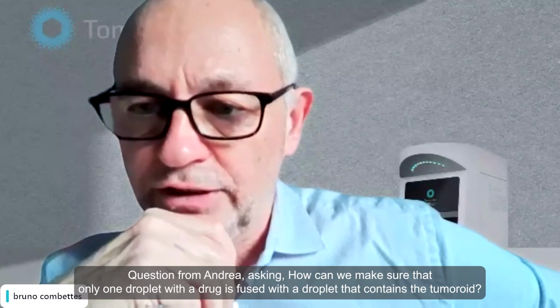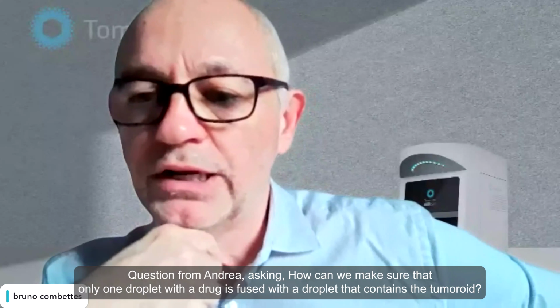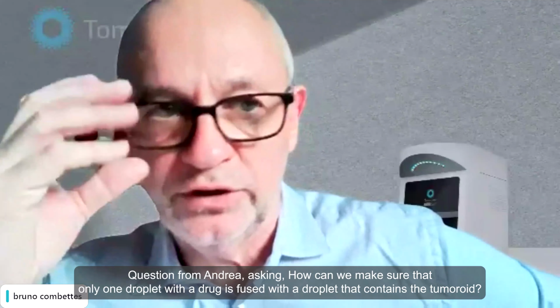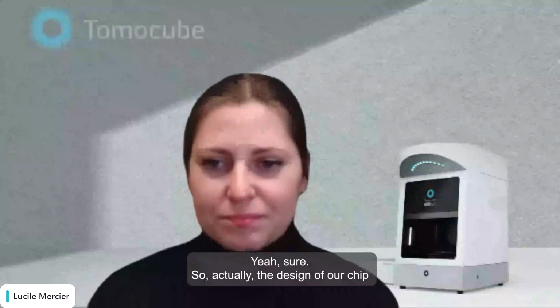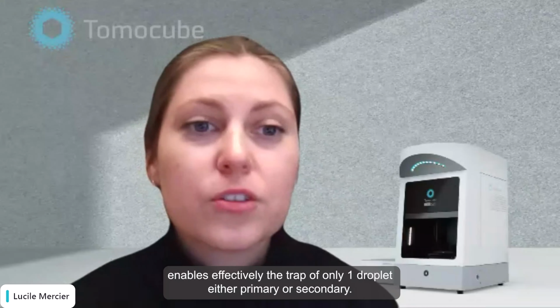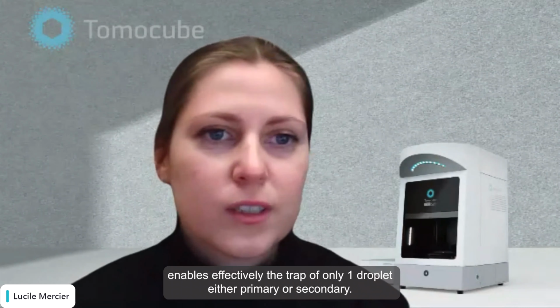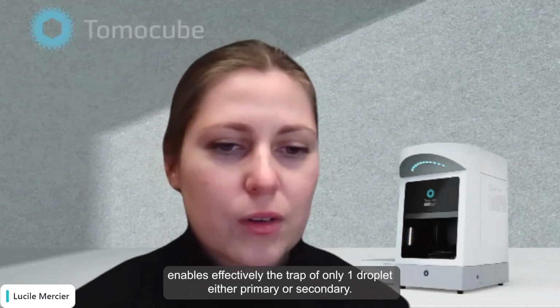Question from Andrea asking, how can we make sure that only one droplet with a drug is fused with a droplet that contains the tumoroid? Can you answer this? Yeah, sure. So actually, the design of our chip effectively enables the trap of only one droplet, either primary or secondary.